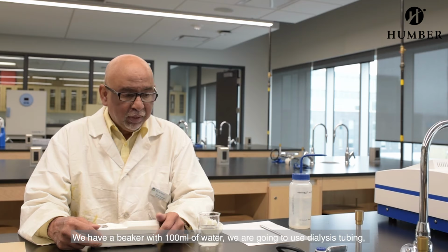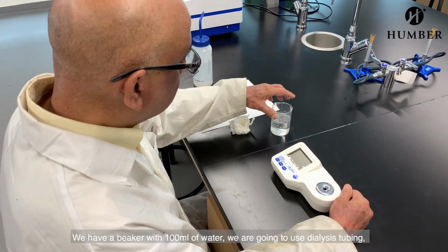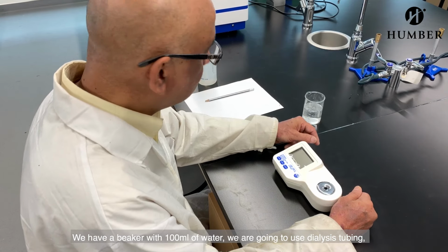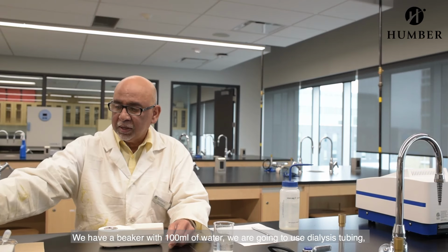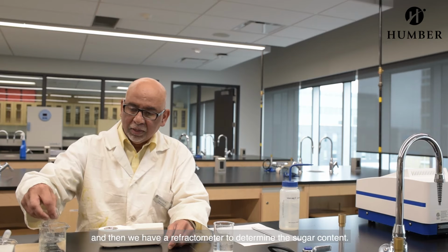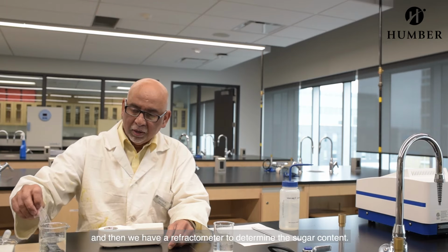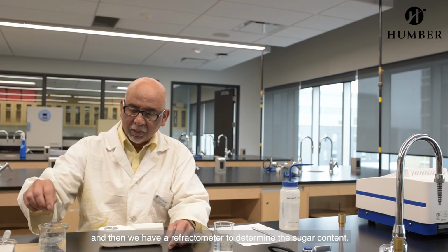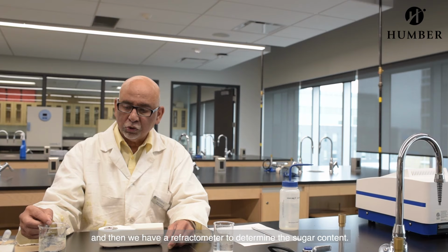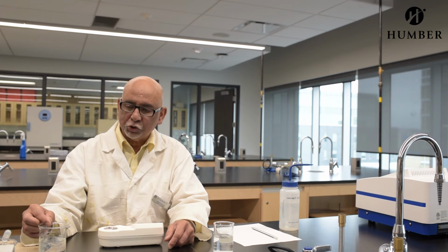So, for that, we're going to have a beaker filled with water. It's about 100 mils, and I'm going to use my dialysis tubings. And then we have a refractometer to determine the sugar. So we're going to put sugar solution into the dialysis tubing.